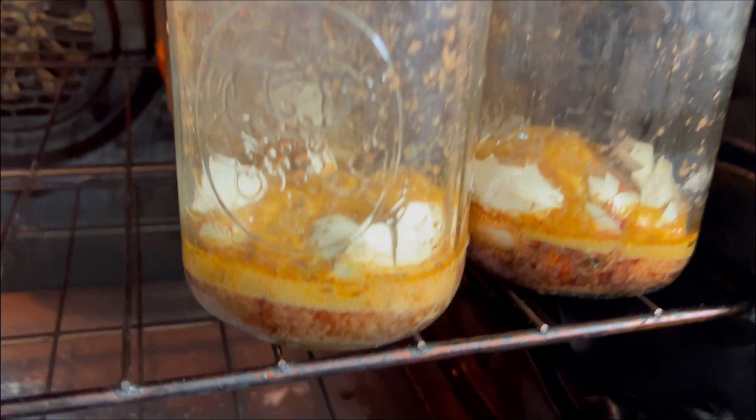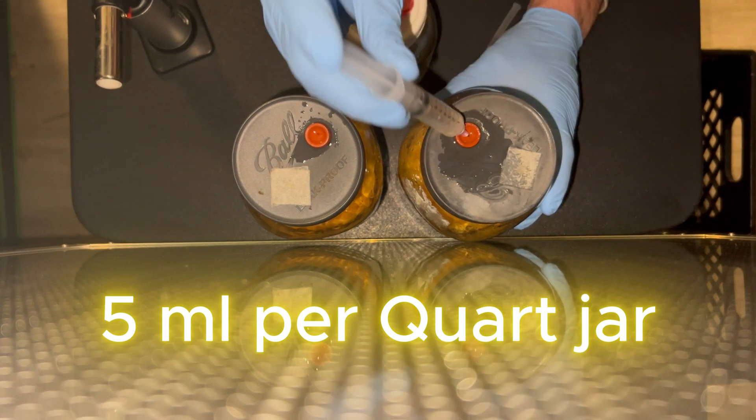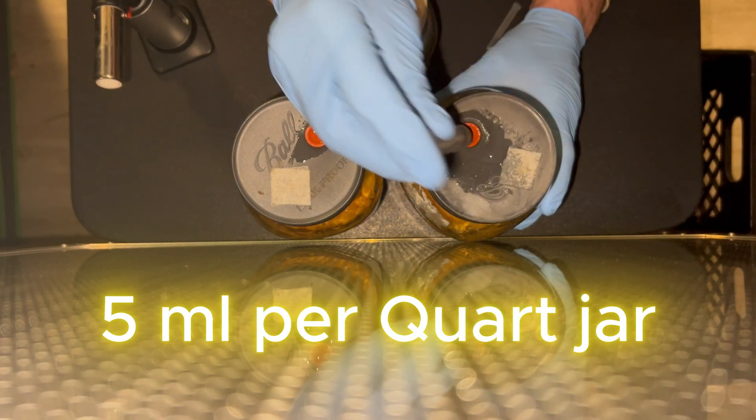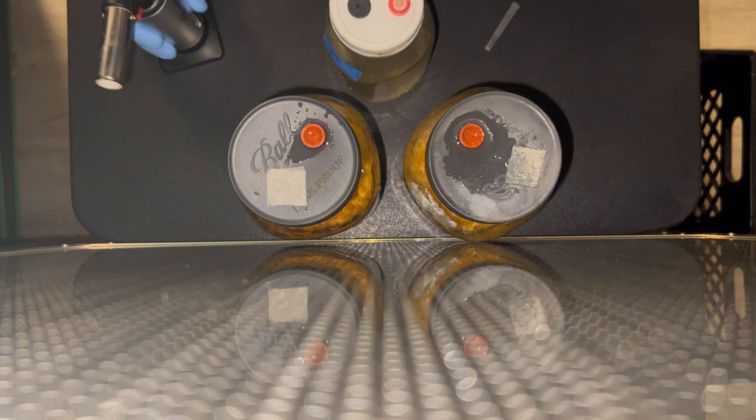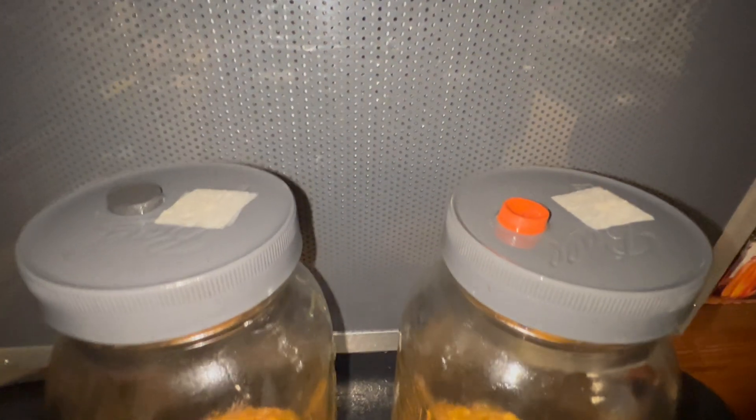After those three hours in the oven, you take out the jars and let them cool. Once those jars are cool, you can inoculate each jar with about two to five milliliters of cordyceps militaris liquid culture. You don't actually need a flow hood to inoculate, but I would recommend using a still air box if you don't have one — and if you don't have a still air box, you can make your own for very cheap. You can also just do it in the open air, because the likelihood of contamination is very low since you're only injecting a sealed jar with the liquid culture.